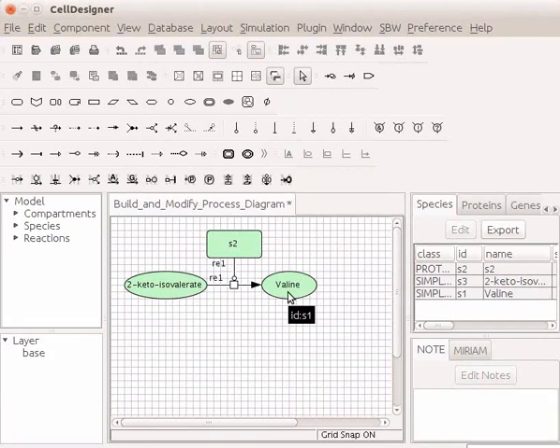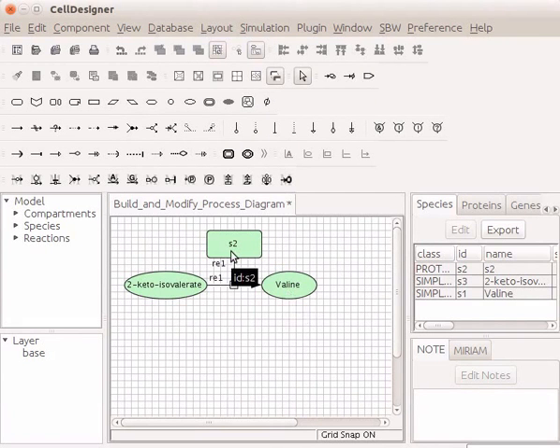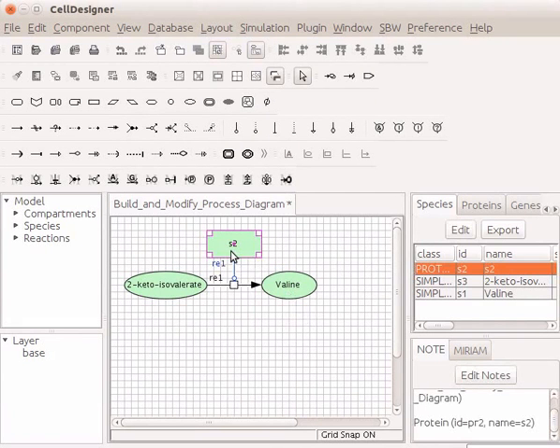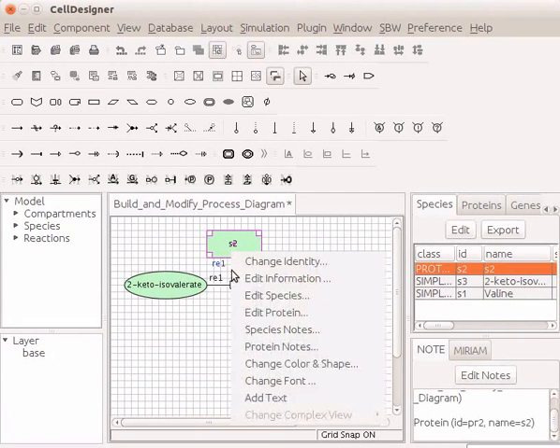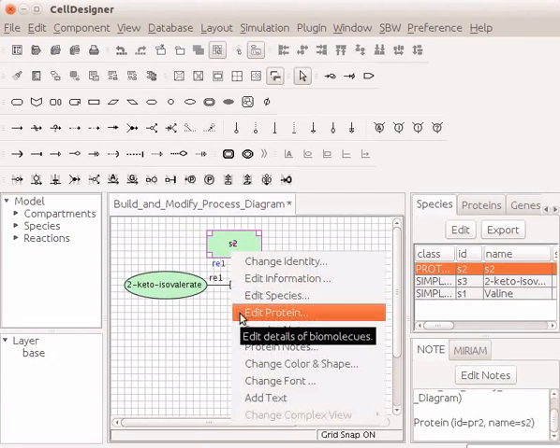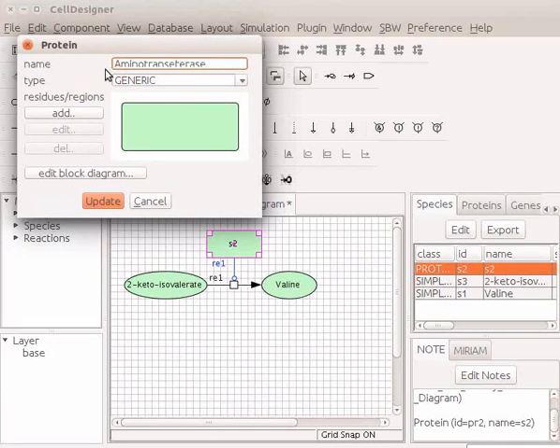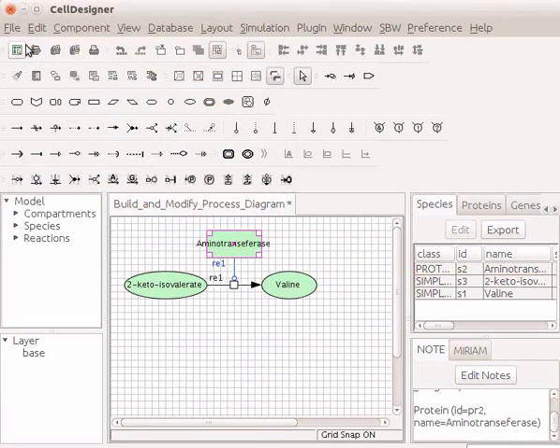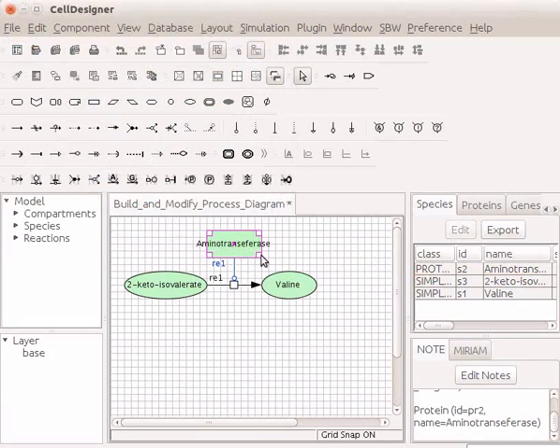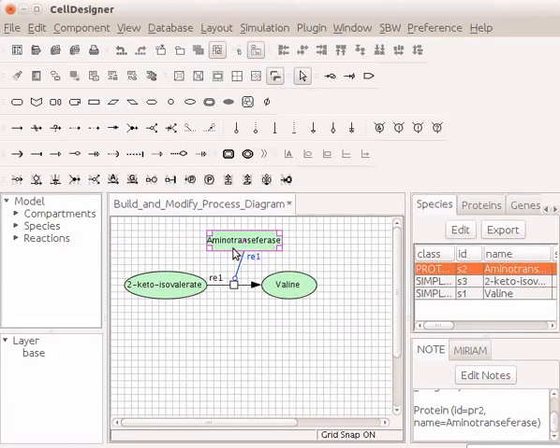Next, rename Catalyst S2. Right-click on it and select Edit Protein. In the Name field, type Aminotransferase. Click on Update and close the dialog box. Drag the corner of the molecule to accommodate the name.